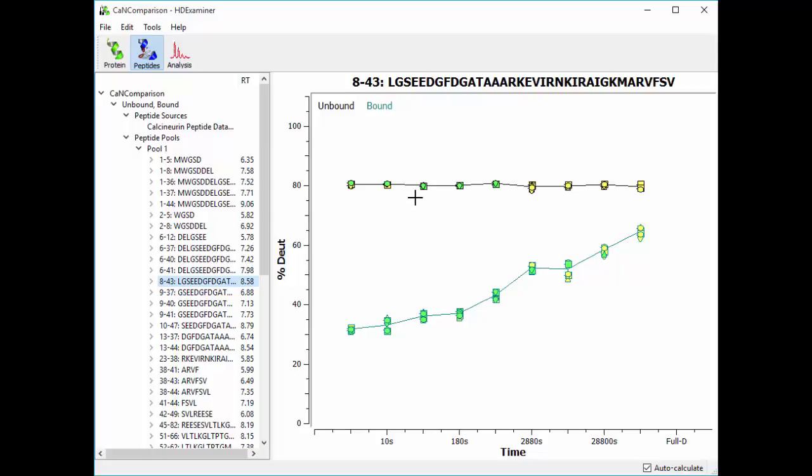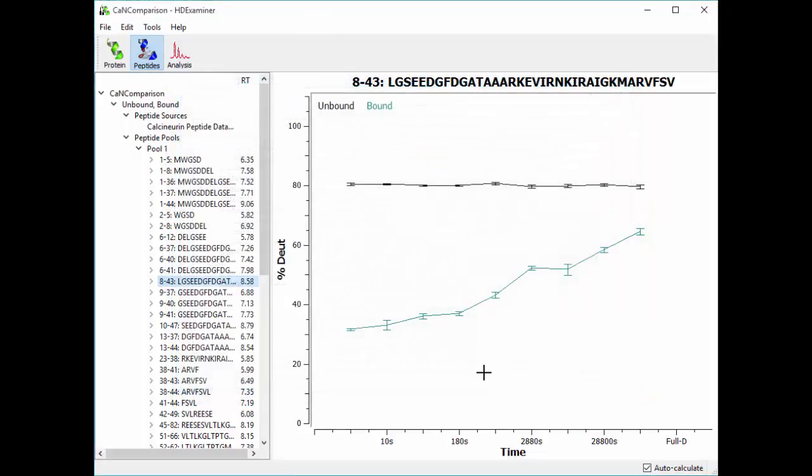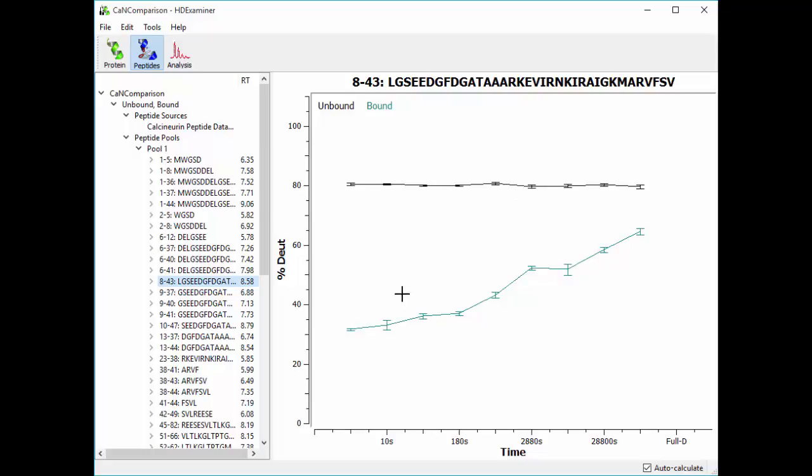These shapes are also shape-coded by charge state. So circle means charge state 1, diamond means 2, triangle means 3, square means 4, etc. You can hide these data points, and you'll see that there are also error bars on the curves based on the number of data points that exist. And in this case, since we have very small, tight error bars that don't overlap, we can be fairly confident that there is a statistically significant difference between the two protein states for this peptide.